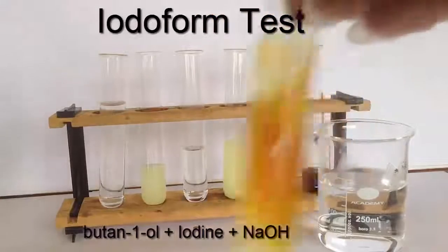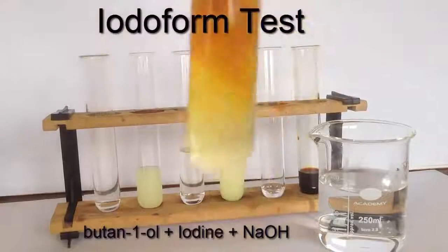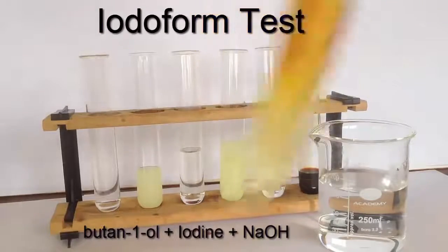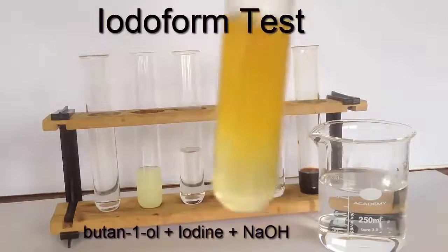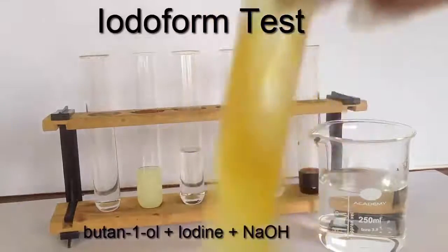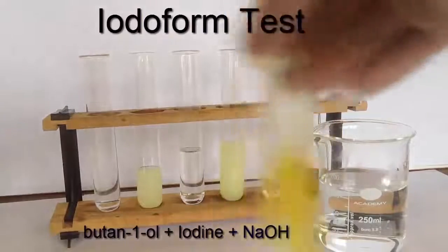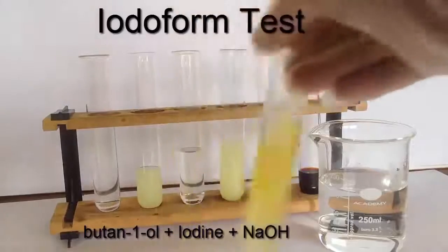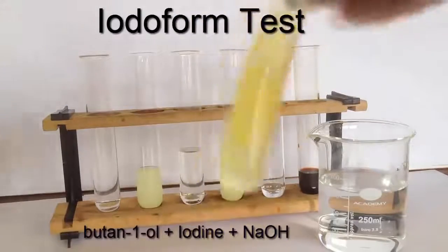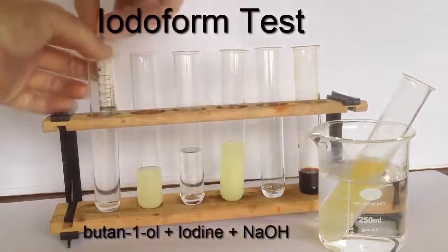Did need a bit more encouragement to see whether it was going to turn into a colorless solution or instead produce a yellow precipitate. So keep watching here. The color is fading. I did feel the need to use the hot water bath in this instance to encourage it. Still not completely clear whether it's going yellow or brown at this stage, but watch it as it sits now in the hot water bath.